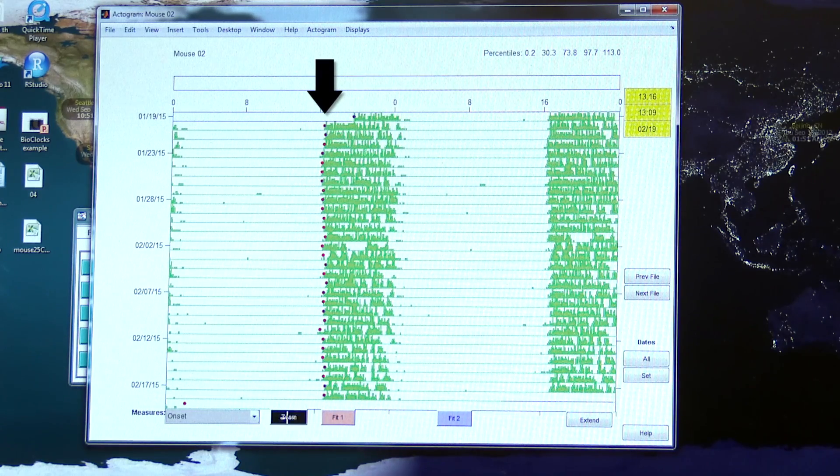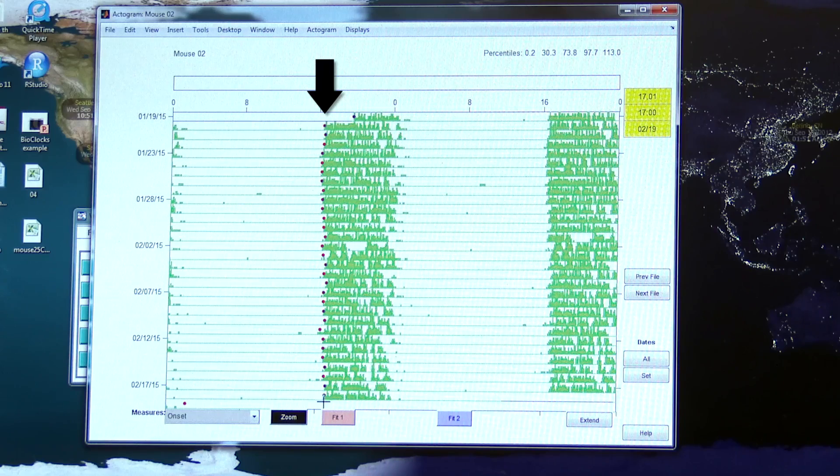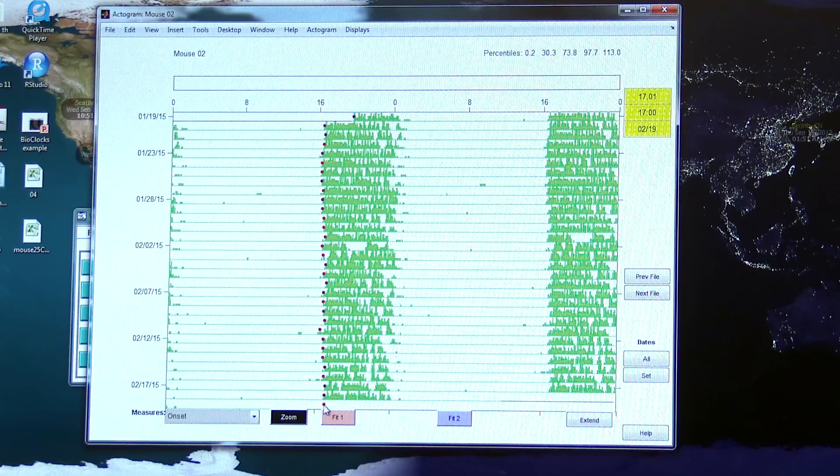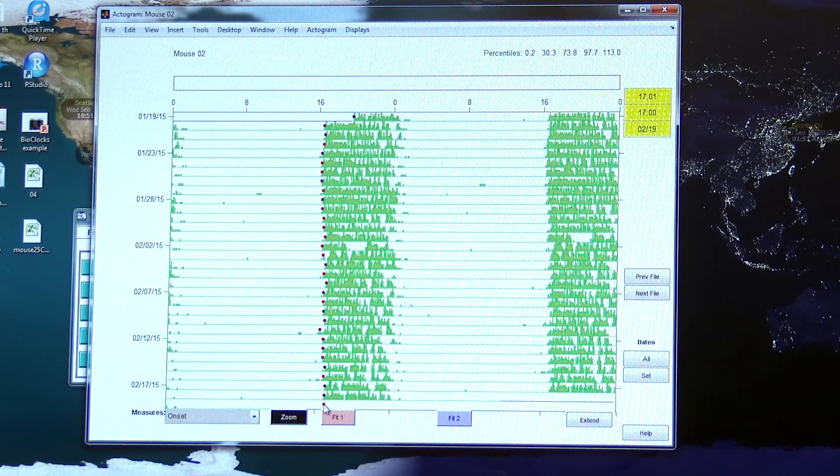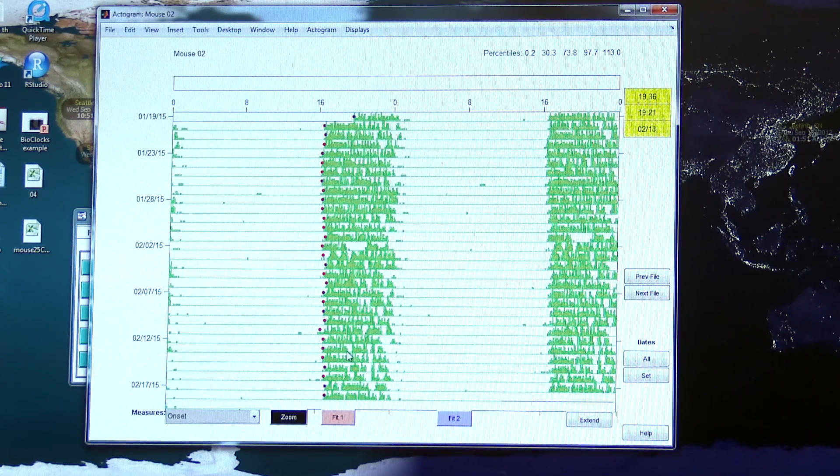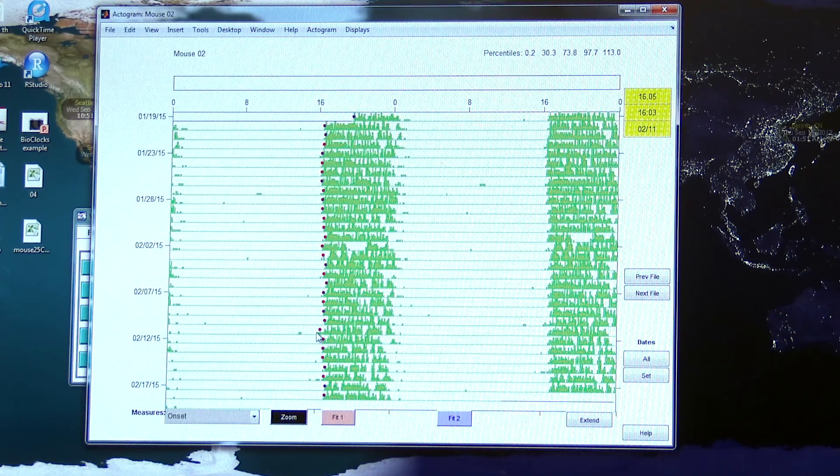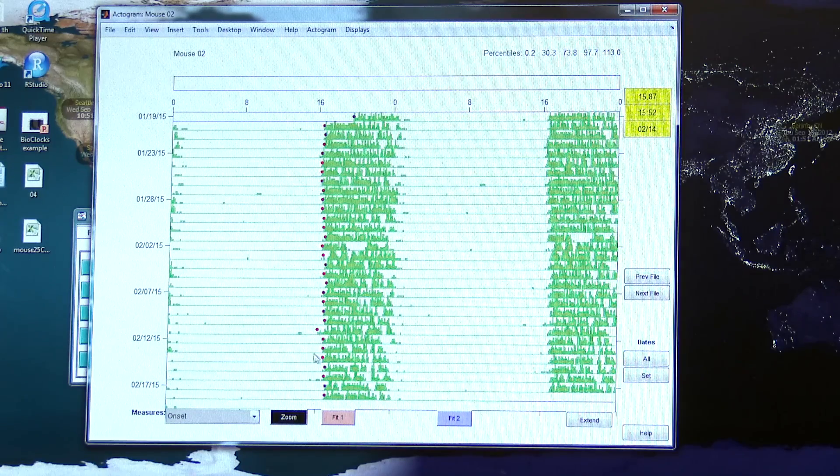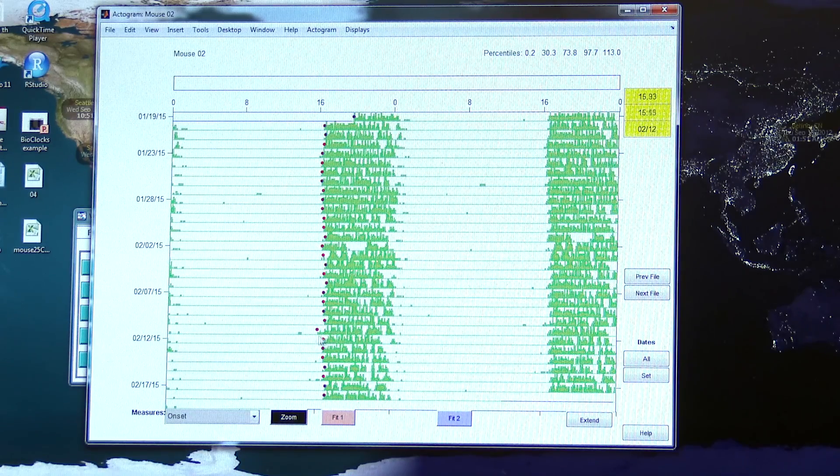You can also manually go through and edit the onsets. If I decide that it looks like the animal started running out here, I can change that.